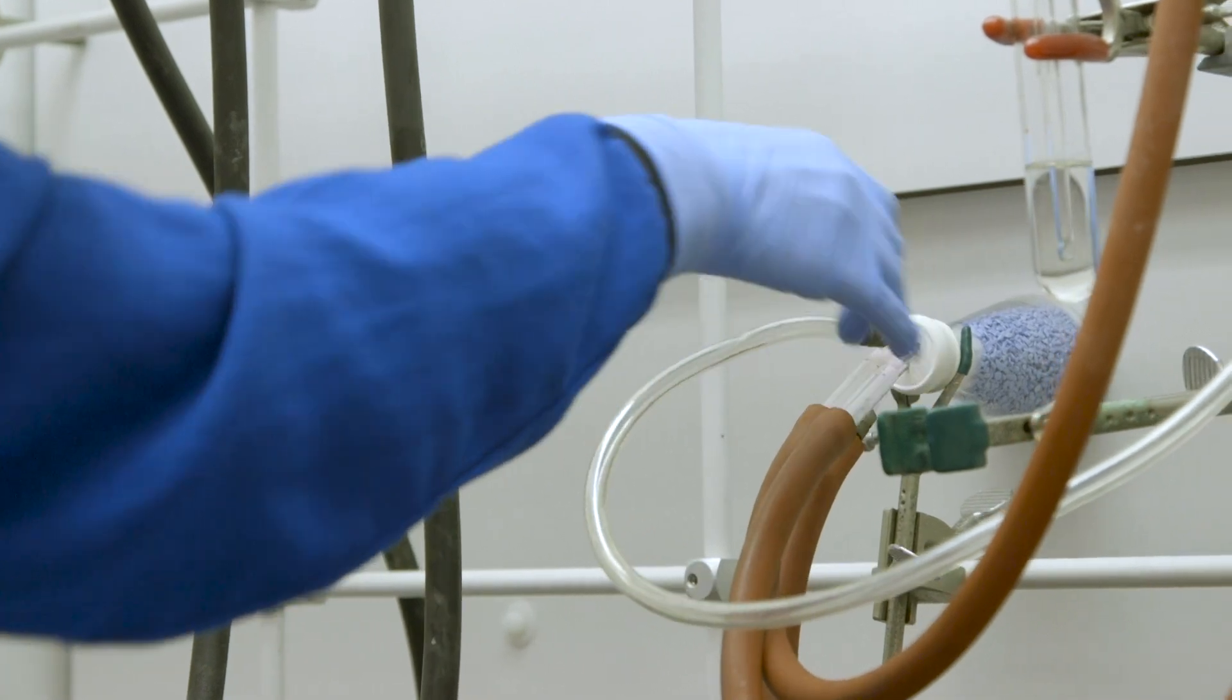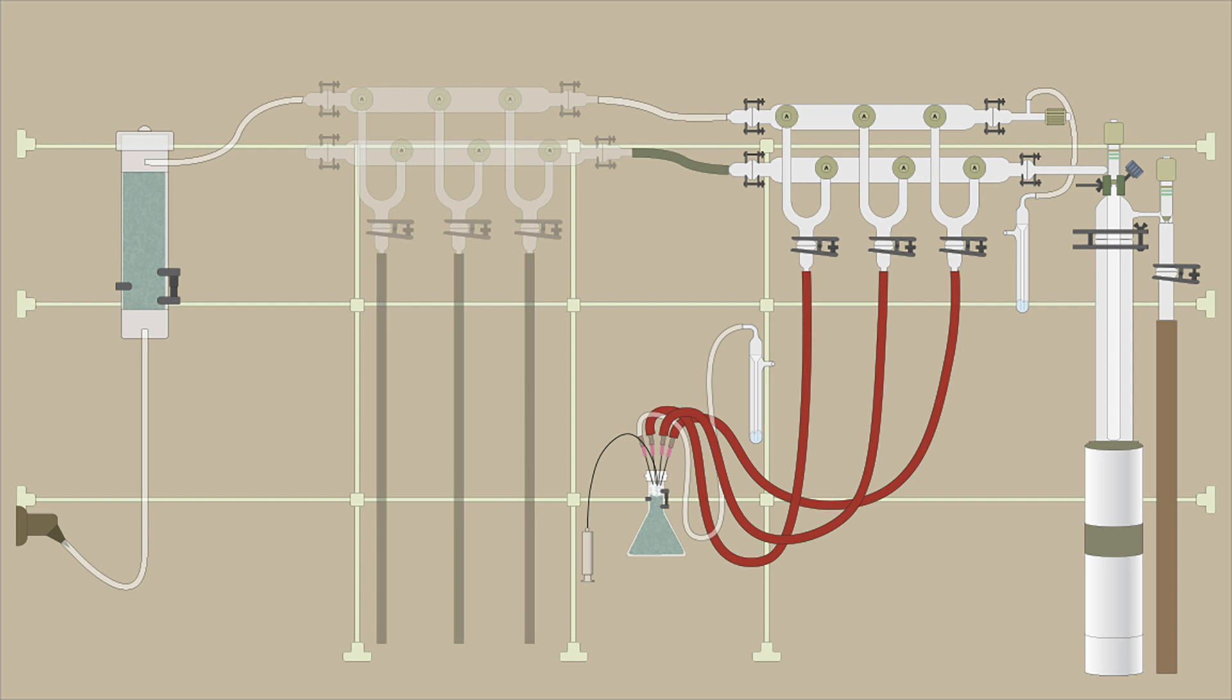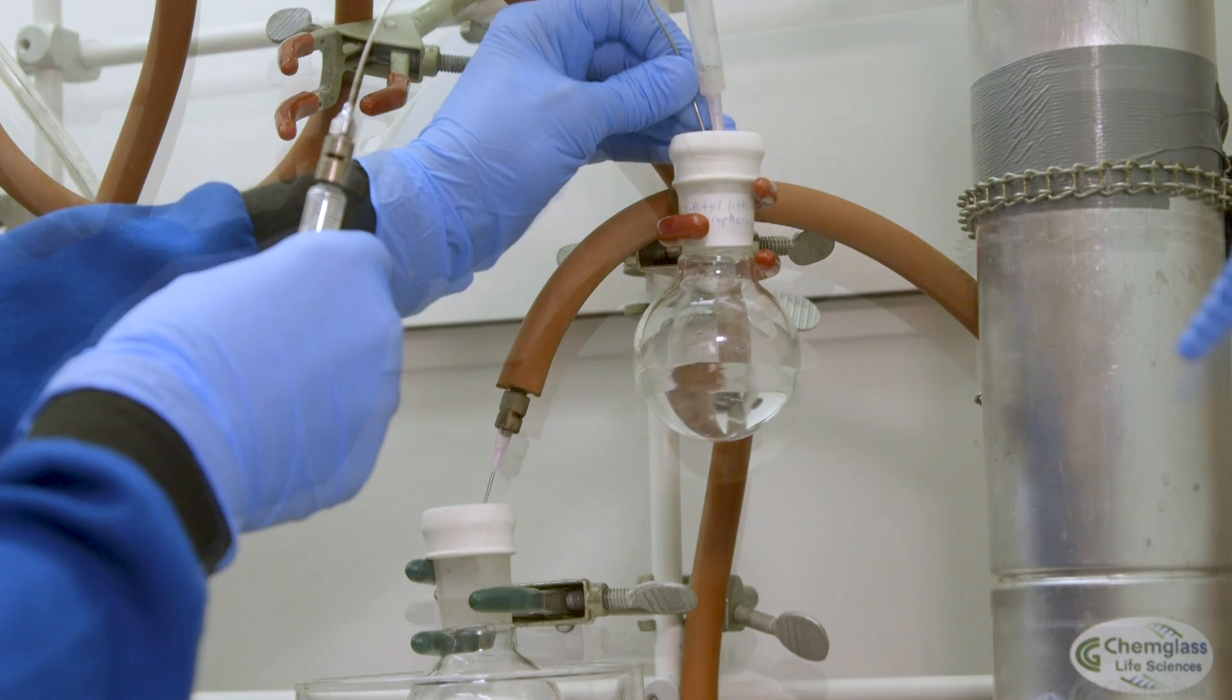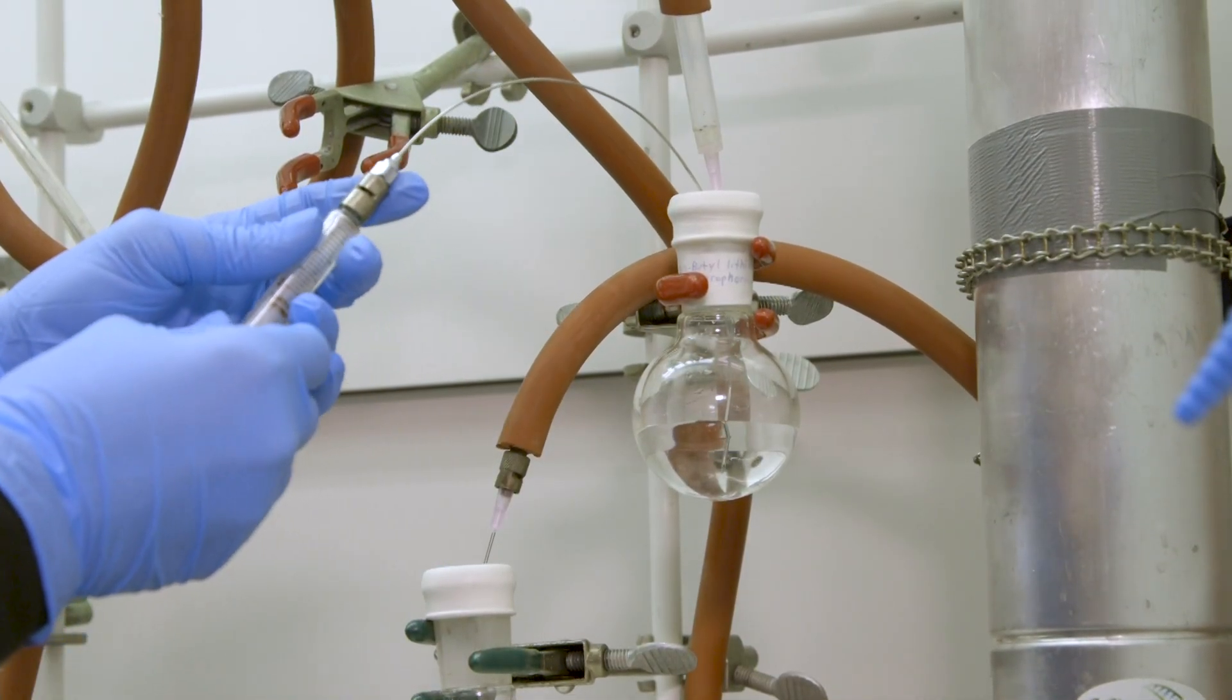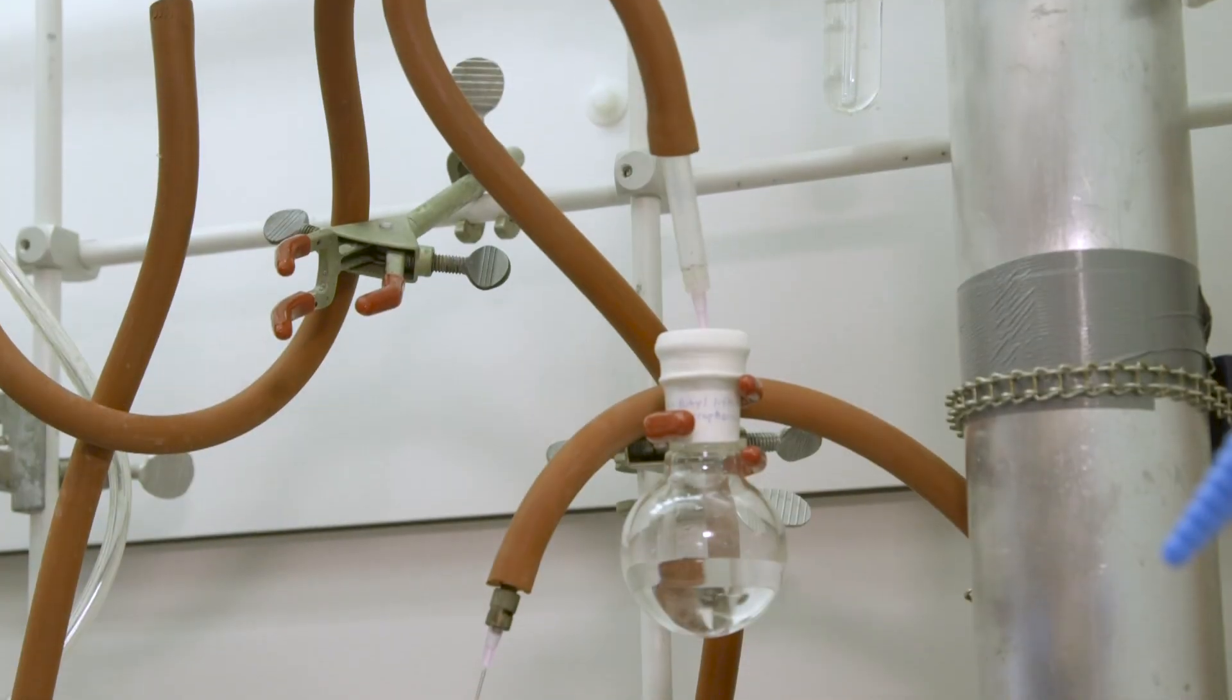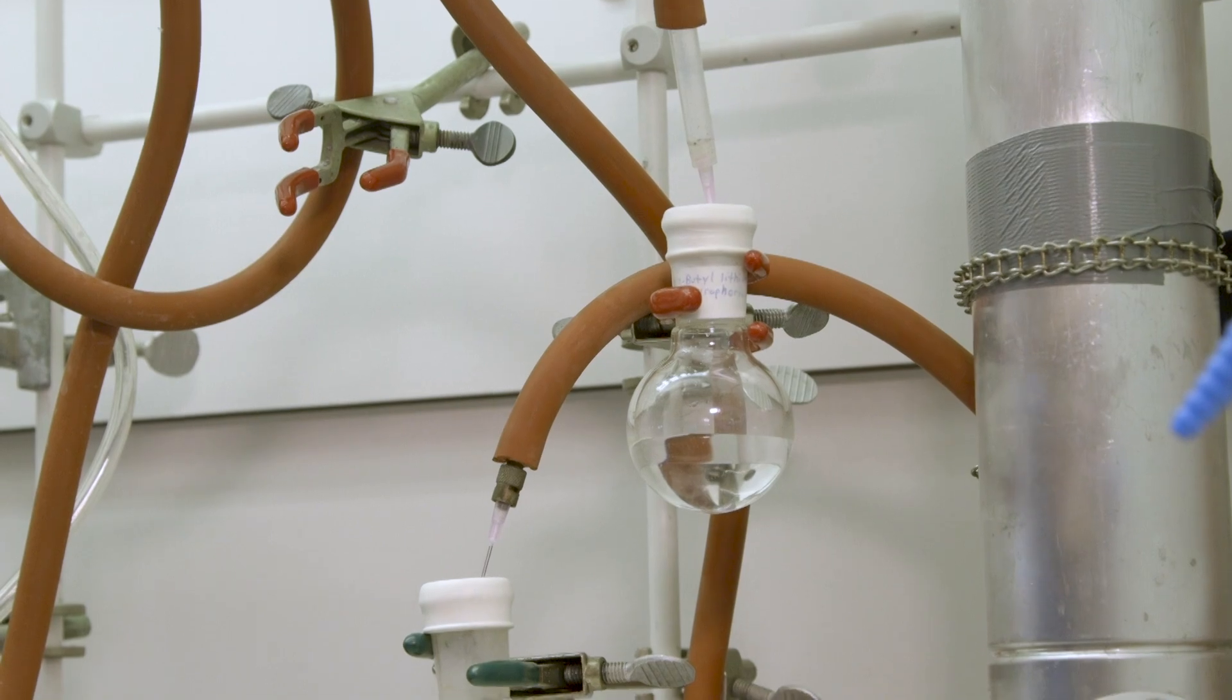After flushing the syringe with inert gas, depress the plunger and stick the needle syringe in the desiccator septum for safe storage. Ensure the apparatus is still in passive mode, supplying inert gas to the reagent vessel. Push the needle into the reagent bottle until it is below the liquid level. With the syringe upright, pull gently on the plunger, watching the inert gas bubbler closely to ensure that the liquid draw rate does not outpace the inert gas flow. This will prevent air intrusion.